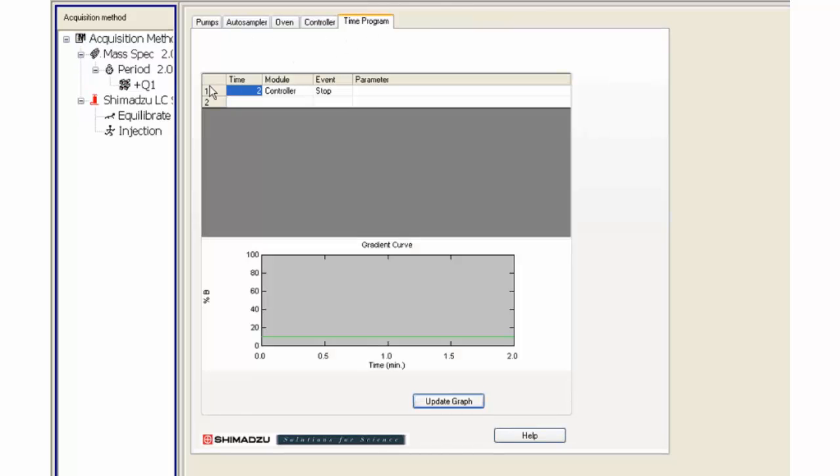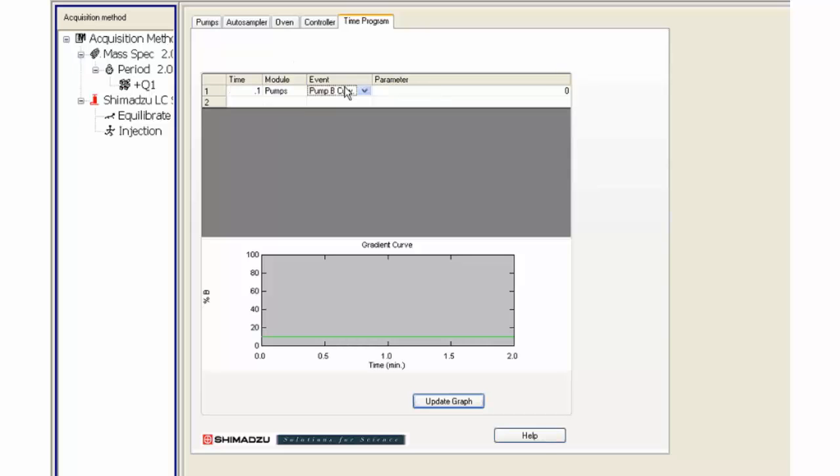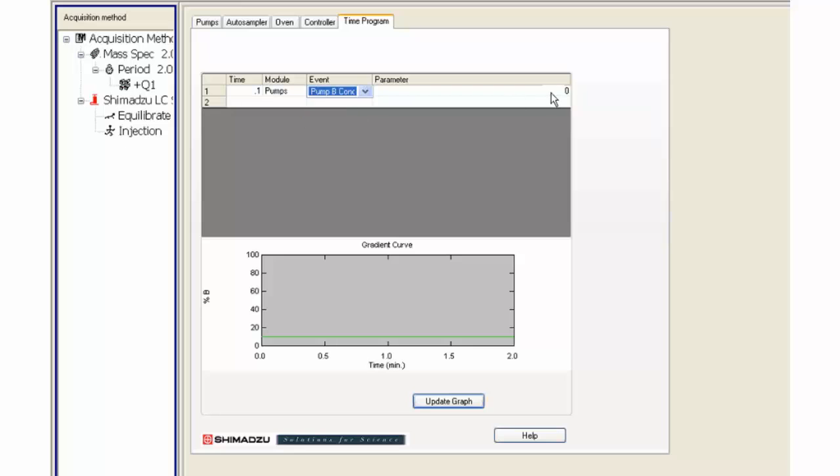Click on the time program tab. Enter a simple time program if you are starting a new method development. Fill in when the initial conditions will start to change if using gradient elution.